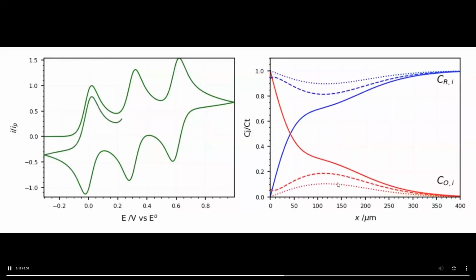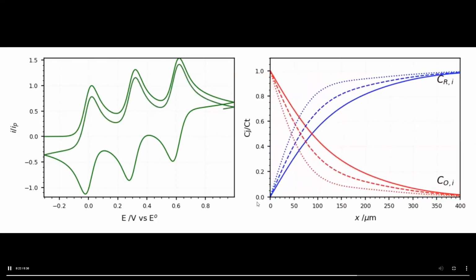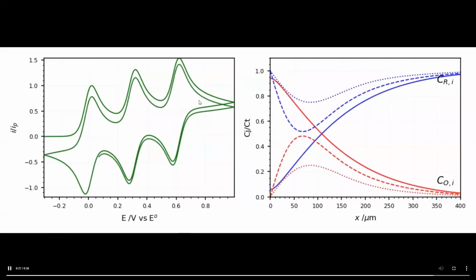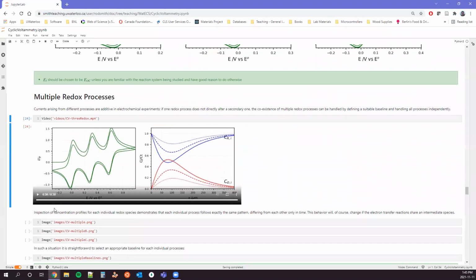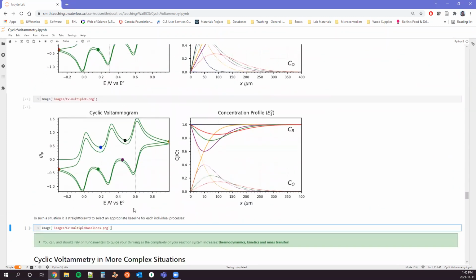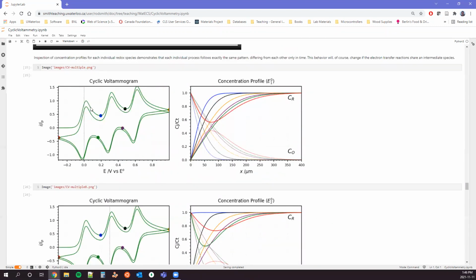All of them are going to have this little wave that extends out into solution. And we're going to act on that wave and see slightly different behavior on the second sweep and the first sweep. Again, this is a situation where they don't interact with each other, so we can freeze these out, same as what we did. I'll go through these fairly quickly and send out images of these later on. This is the concentration profile for this first redox couple, where the dashed line is. For the blue, the black, the orange, the purple, and the green, all that we're doing is extending that diffusion layer out into solution.